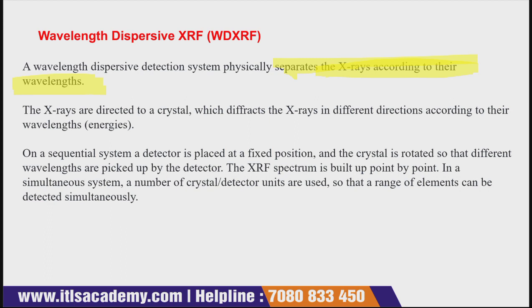Again, I am telling you in detail, what do you understand by wavelength spectroscopy? This technique, or methodology, has the basic idea of separating the x-rays according to their wavelength.